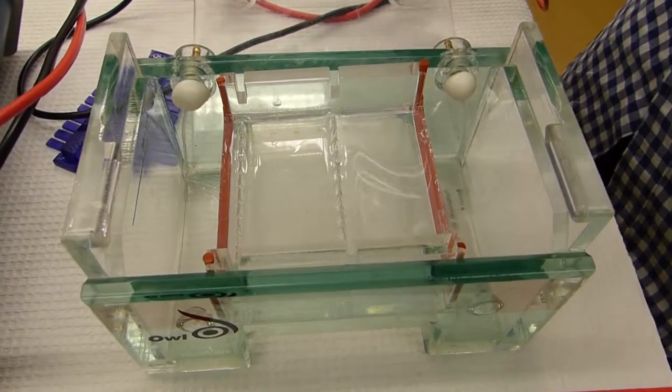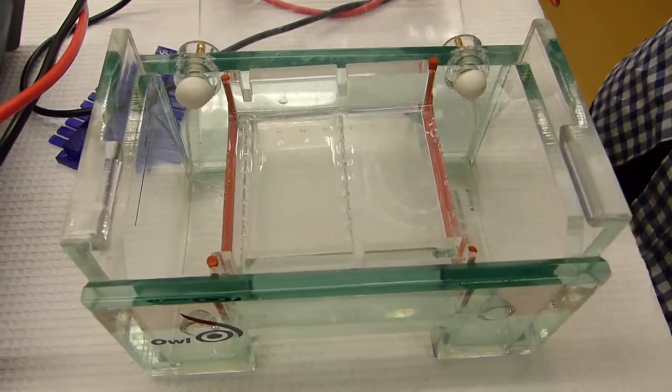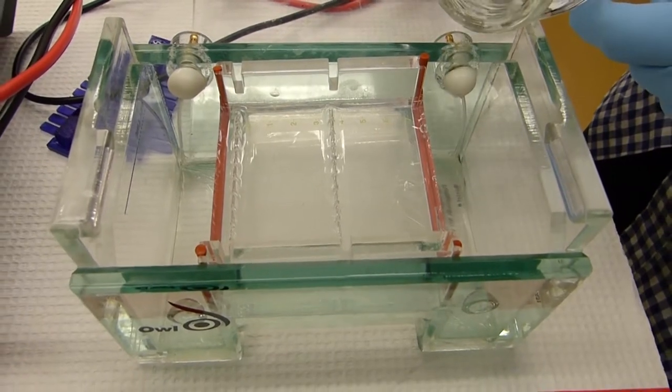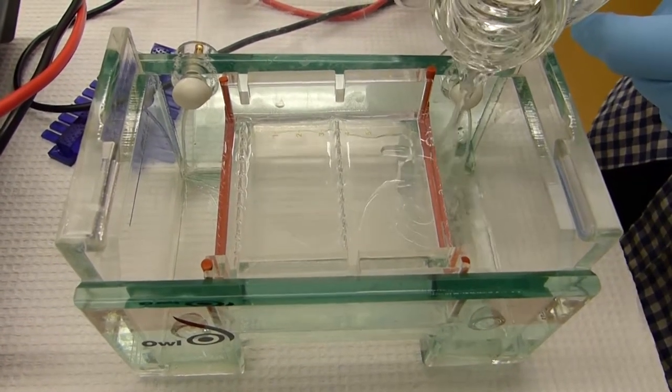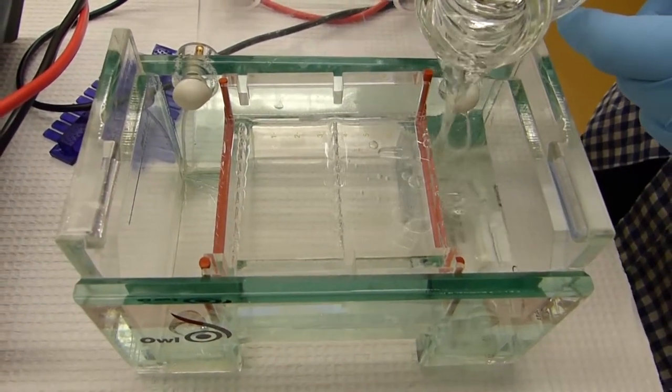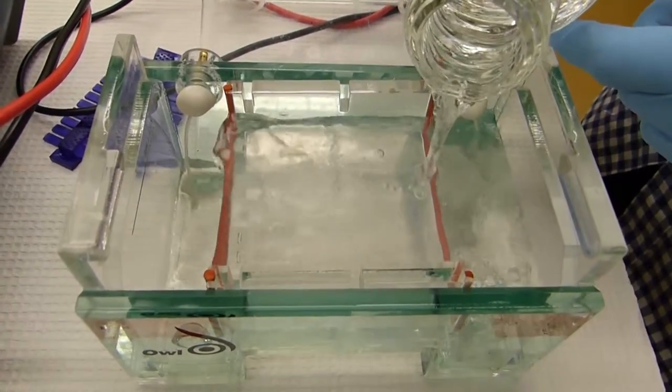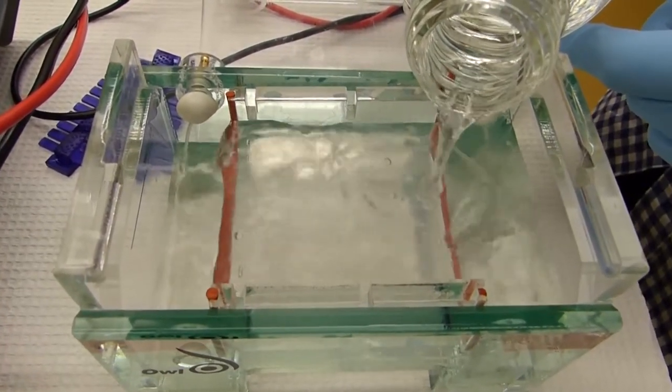Once the gel is set, you add your running buffer which is 1X TAE which will be sitting by the gels. You can add this to one side, on top, to both sides. And you just add it till it reaches the fill line marked on the side of the box.